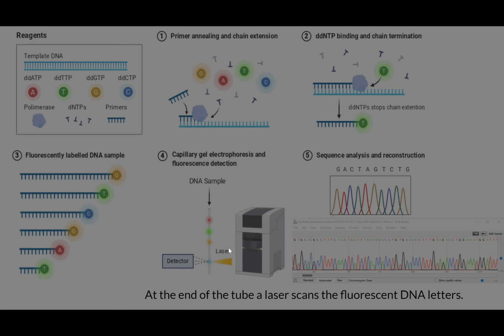So this is old school. You can't really generate a lot of data this way, but the data you do generate is pretty robust, and you can look at the raw signal and interpret that, although a computer program will read it for you. You just have to double check it sometimes.